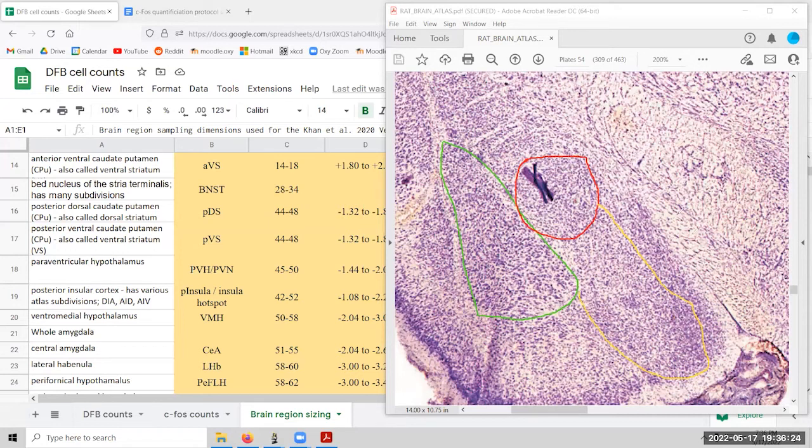Our optic tract is over here. You can see that it's a lot easier to see compared to a lot of other things. So the optic tract is that sliver there. We'll do another color like a light blue. This one here is that internal capsule slash cerebral peduncle thing I mentioned before. So that goes all the way up into here, so to speak. It actually might extend more like this. It's a little hard to tell at this level. Additionally, another fiber tract region that I mentioned before, which is an extension of the corpus callosum, exists over here. That's this faint white line on this side that ends right about around the base of where the basal lateral amygdala ends.